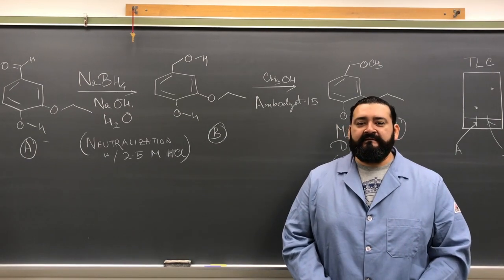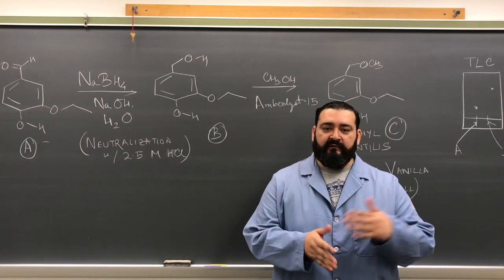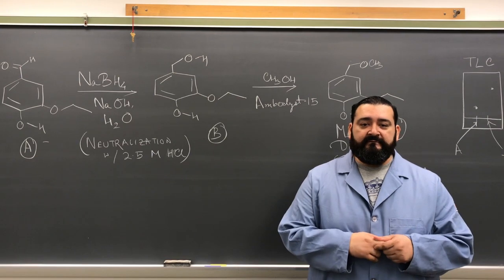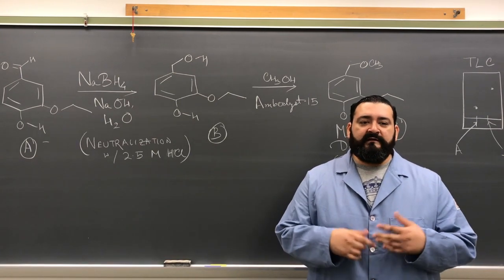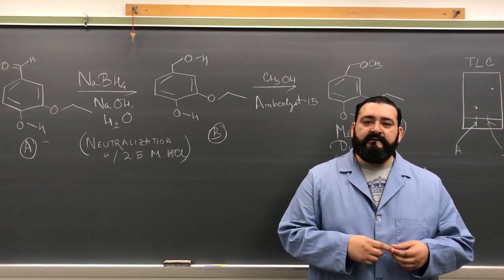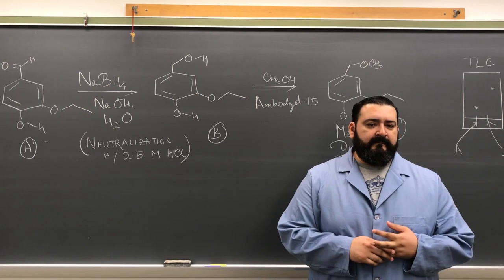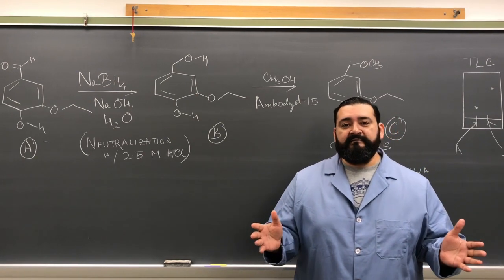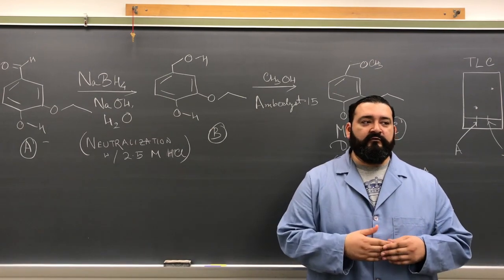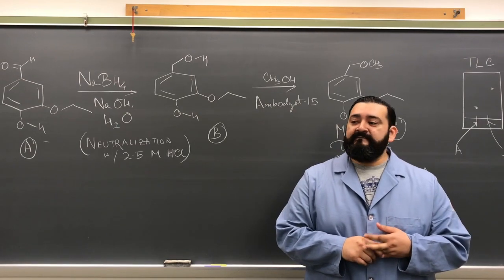Just a few things for the experiment also. We'll be showing you small clips as we go along so that you can take notes. Make sure you take very good notes of the things that are happening. If we weigh something out, we'll probably tell you how much it is before we add it. So you just write down your observations, what you see, and things like that. Hopefully we don't make this into a very long video. Like I said, we'll try to show you small clips that we'll label so that you know how to follow this video.